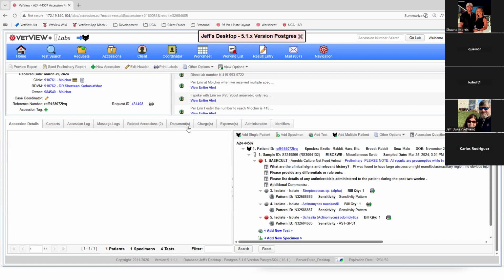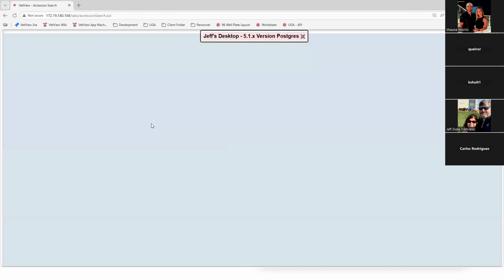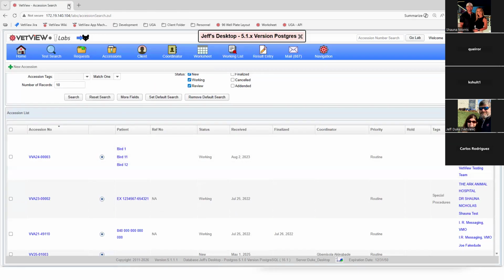All right. And then let's see. So now let's jump into actually finding cases. We talked about general navigation, how to move around in the system, again, being web-based. When you go to one of our search screens here, remember, it's a hyperlink system. Let me take this range off here. Search. And you can also use the tabs across.